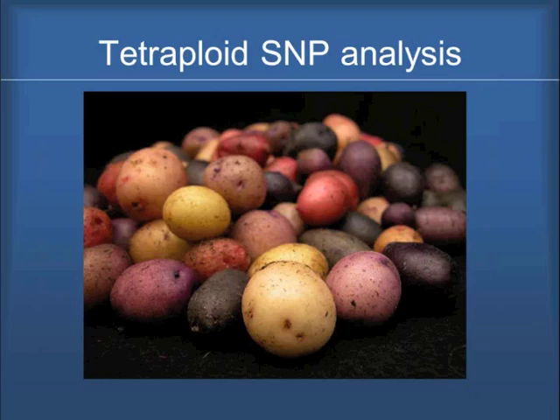If you're working with a service provider, they may just give you the Genome Studio file, essentially an Excel format, but you still need to go through with your own criteria in terms of eliminating progeny that don't have enough SNPs on them or markers that have too much missing data. So the step-by-step process that you've articulated is appropriate for any software that a user might choose to go with.